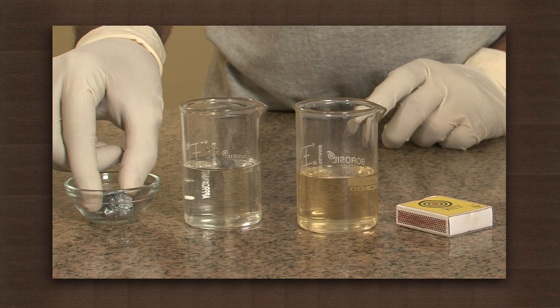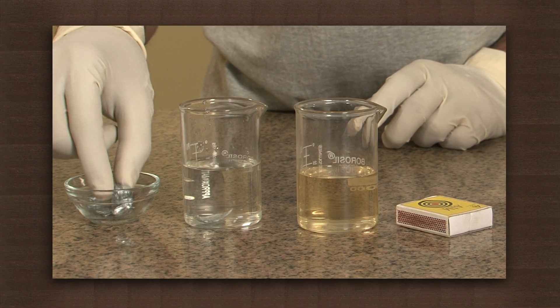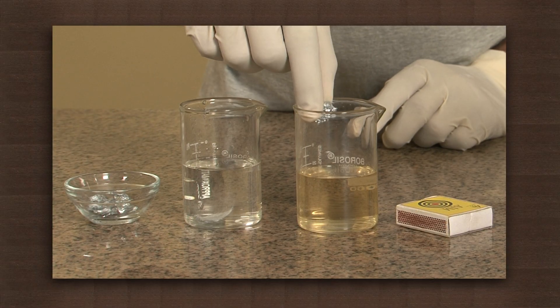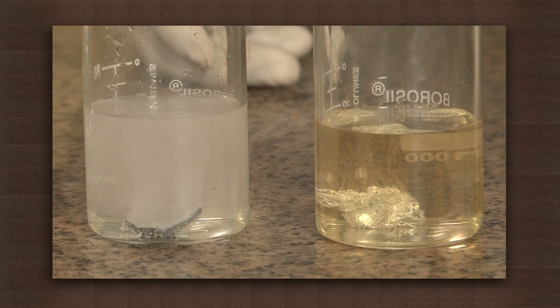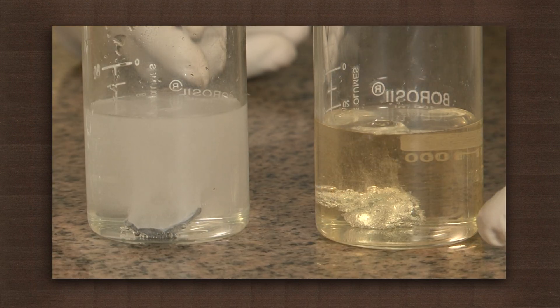We will put zinc granules in both the beakers. You will observe that zinc reacts with acids and releases a gas. What is the gas which is formed?